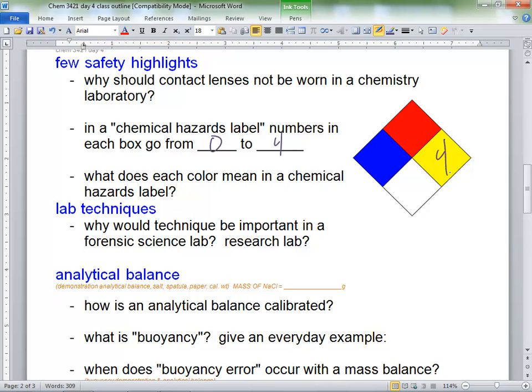Let's say here's a cap. This is a bottle. I can't really seal it, but you have to pretend this is a bottle, okay? And it's been sitting in the chemical storage area over there behind Mungia's office, and there's dust on it and everything. And you look at it, and it's probably not even yellow anymore, right? But it's got a 4 in that box in the corner. This is what I would be doing.